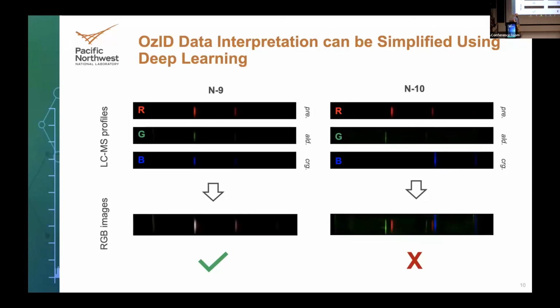And even easier, the last point I'll add is that we were using an off-the-shelf ResNet-18. It's already been trained on insanely huge sets of image data, so it has already learned some very complex image patterns to activate on. We just took that and trained a few layers at the bottom, more or less, specifically for our task.